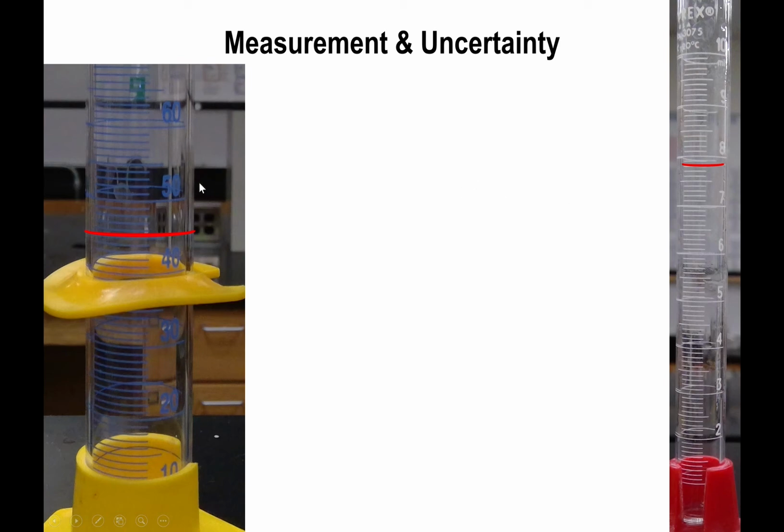Now, if you look at the reading, the idea is that you have to pay attention to the innermost ticks, in particular the space in between them. So notice that in the big graduated cylinder, the big marks are in volumes of tens, right? So it goes from 50 to 60 mLs to 70, etc. But then you have these marks in between, and if you count them, you have 1, 2, 3, 4, 5, 6, 7, 8, 9, and 10. So you have marks that go down to single units, right? So this will be 51, that will be 52, 53, etc.